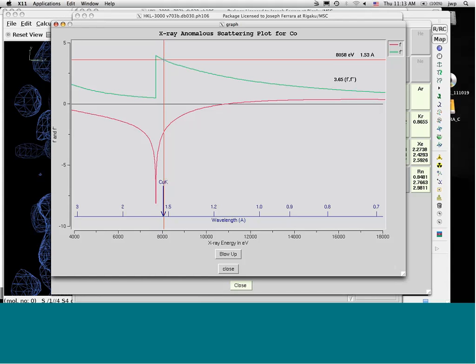to spend your time on getting better crystals and becoming better at mounting them, so they don't slip and so on. So I do know this, like crystal slippage sometimes is not really the crystal slipping. It's some of these cryopins, if they don't warm the bases up to room temperature, they will be moving quite a bit. And at these fast beam lines, sometimes people don't give it a chance to come to thermal equilibrium, and the difference in the thermal expansion coefficients of all the metals and everything cause these things to move around in the beam a little bit, and that can degrade the signal and increase the signal to noise.